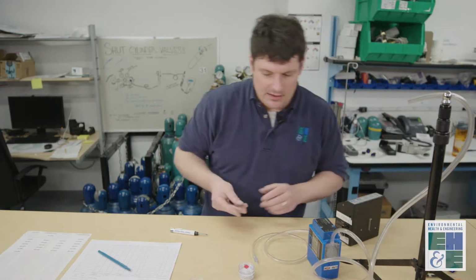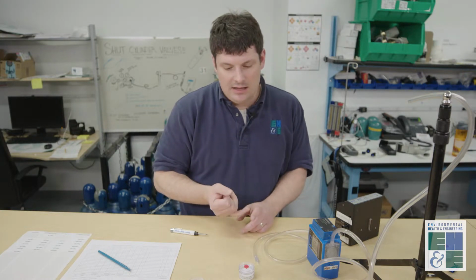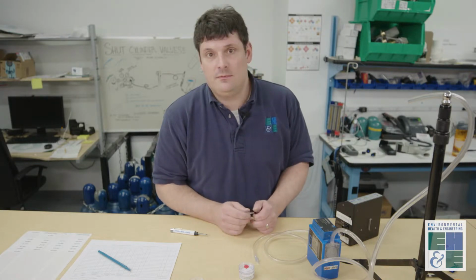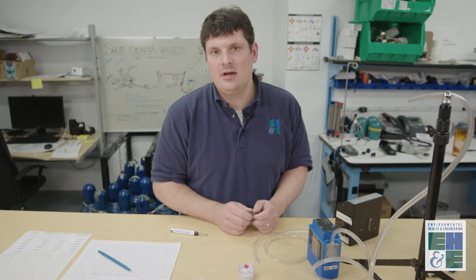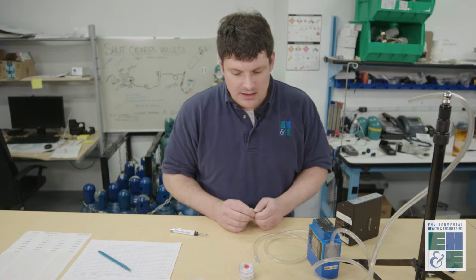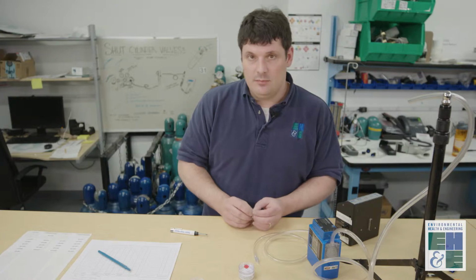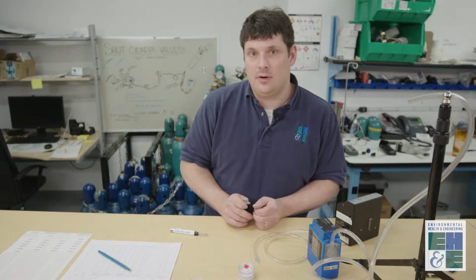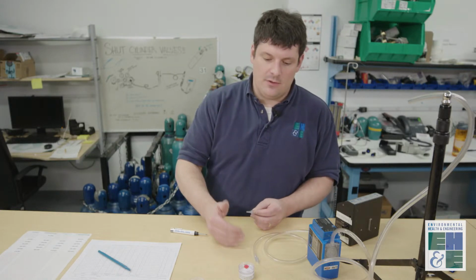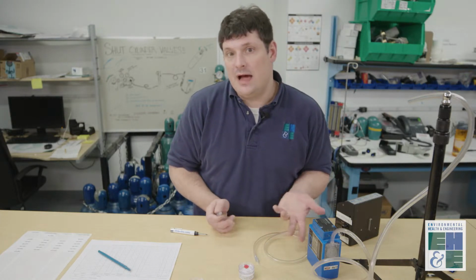We're going to be collecting samples with the appropriate media that's obtained from the laboratory. And these samples can be collected for various durations of time, from 15 minutes for short-term exposure limit samples to full shift 8-hour samples, or even longer, depending on the circumstances. The flow rates vary depending on the method, and can range from 0.1 liters per minute up to 5 liters a minute. And so it really is a wide variety of media, flow rates, durations that can be collected using this method. It will be outlined in the project plan.